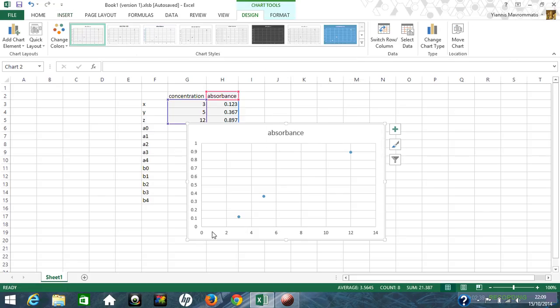And what you see here very quickly is a graph where you have on the y-axis your absorbance, on the x-axis you have your concentration. Clearly, for a coursework or for any decent graph, you need to have units, axis titles, and so on. But at the moment, I'm just showing you the principle. And you have the three values here from your standards.